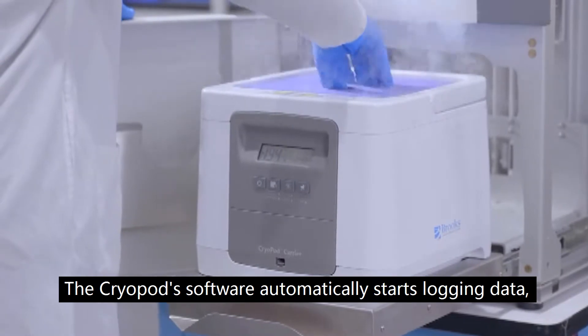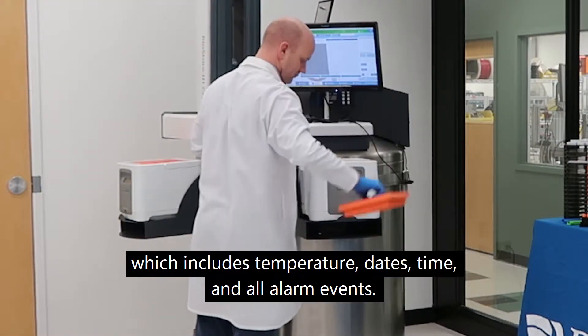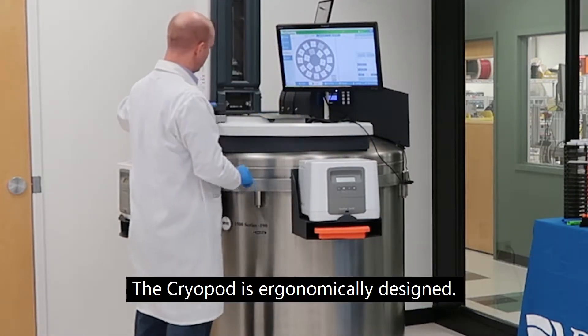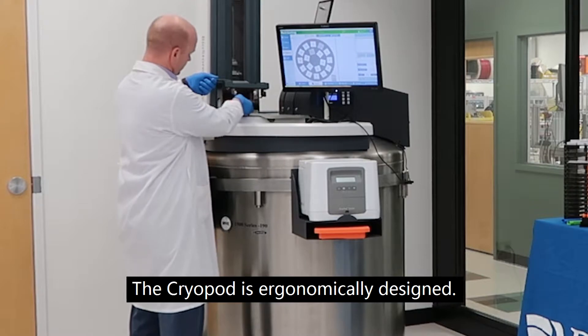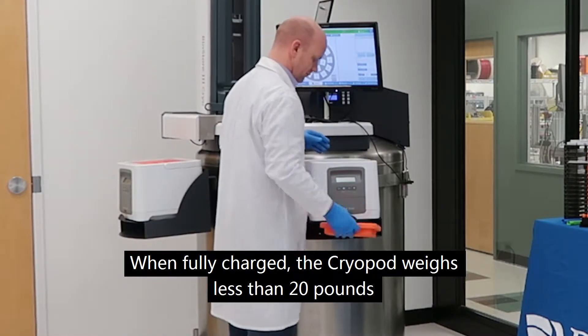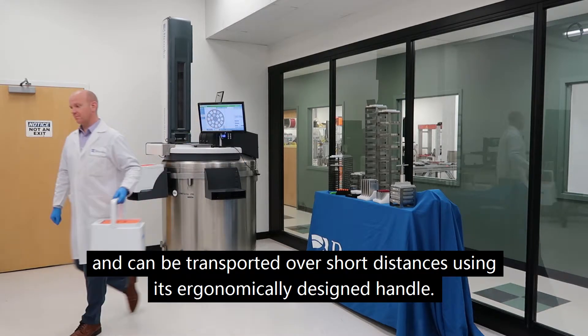The cryopod software automatically starts logging data, which includes temperature, date, time, and all alarm events. The cryopod is ergonomically designed. When fully charged, the cryopod weighs less than 20 pounds and can be transported over short distances using its ergonomically designed handle.